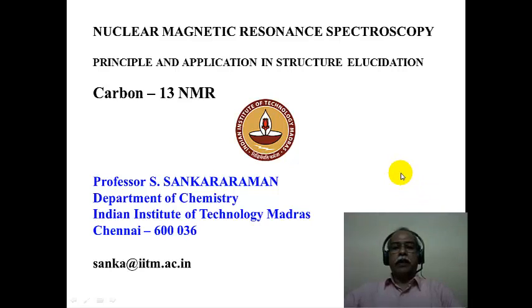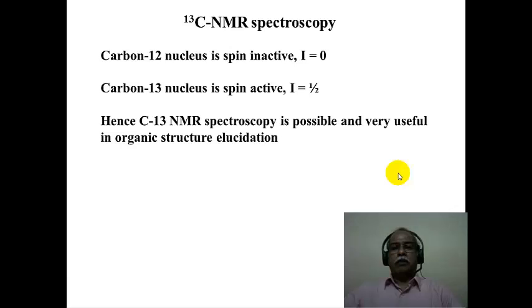Welcome to Module 8 of the course on application of spectroscopic methods in molecular structure determination. In this module, we will consider carbon-13 NMR spectroscopy. Just like proton NMR spectroscopy, carbon-13 NMR spectroscopy is also a very valuable tool in structure elucidation problems.